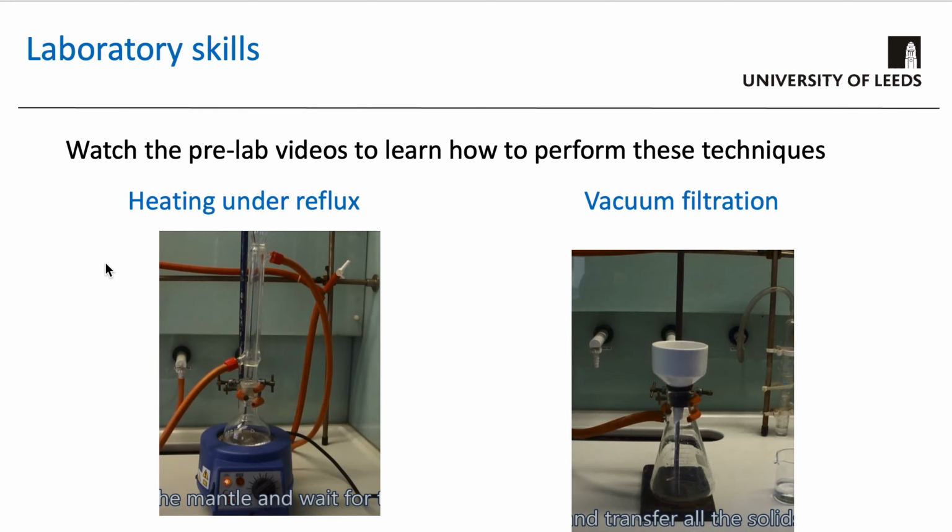So in addition to this video, there are more pre-lab videos that show you how to perform these techniques, how to set up and run a reaction under reflux, and how to perform a vacuum filtration. Do watch these videos because they will ensure that you perform the techniques correctly. You'll be able to work through the experiment much quicker, things will work a lot better, and you'll get a higher yield and better results as a result of watching these videos.